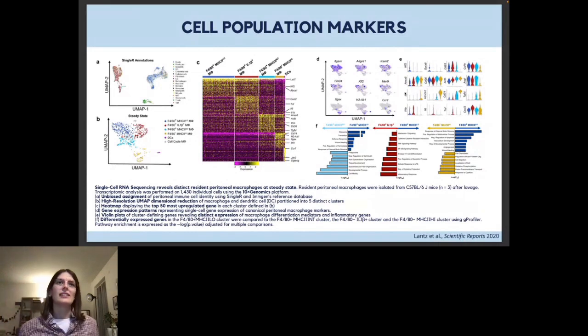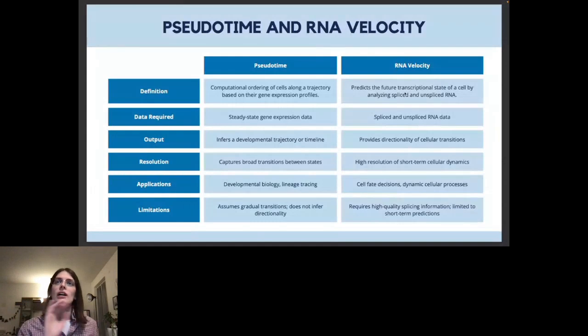And these I just leave here for your knowledge. The pseudotime and RNA velocity are fairly novel analyses and calculations you can perform on RNA-seq data. If you want to perform this kind of analysis, you also need to have it in mind when you set up the experiment, because in the RNA velocity case, you have to have information on the spliced and unspliced RNA data. So you can maybe choose a library that allows you to see that. These are just very superficial points of this analysis, but I leave them here to give you an idea.